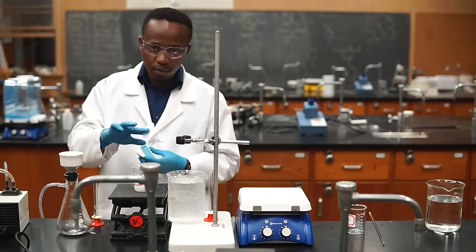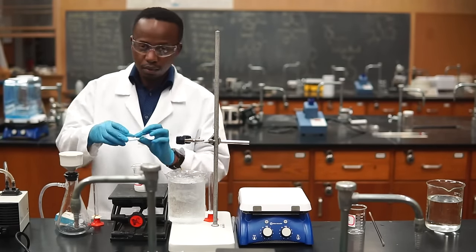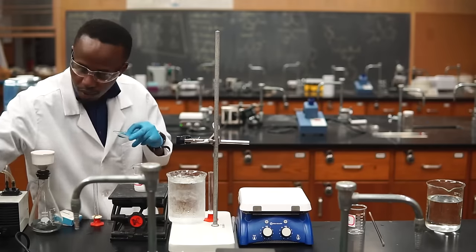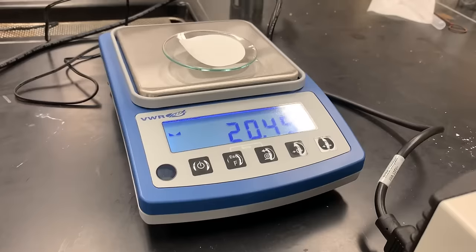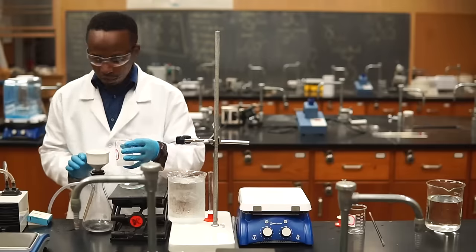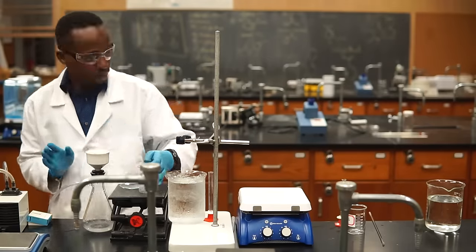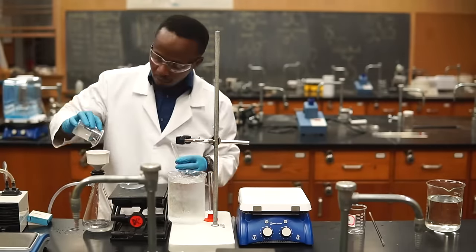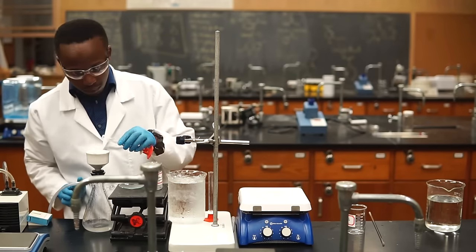Let's bring in the vacuum system again to dry our product one last time. Before we do that, we'll weigh our filter paper and watch glass, as this will be used to measure the mass of our product. Now, let's add the same filter paper to the vacuum system and start filtering. Let this go for a few minutes to make sure it's dry.